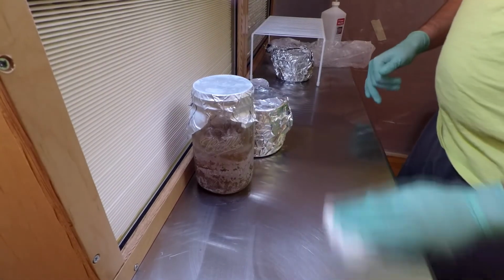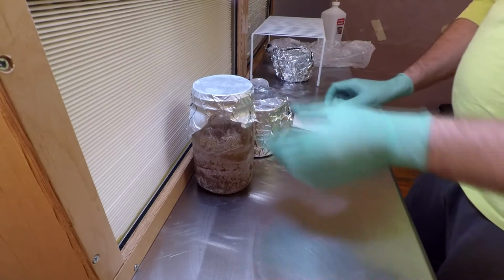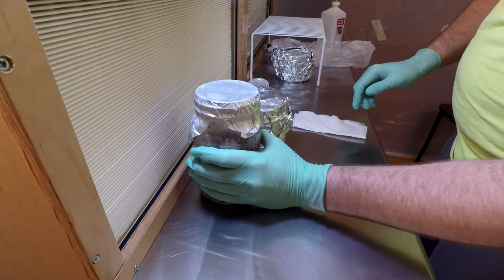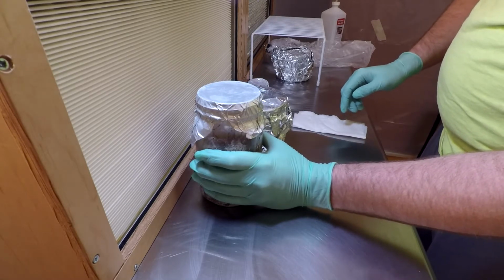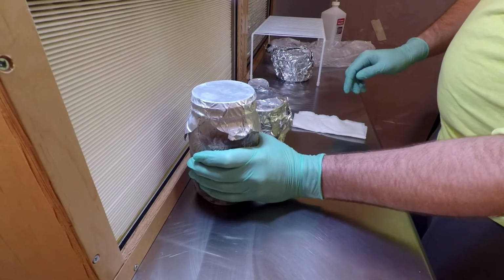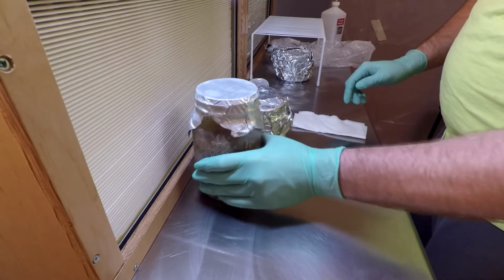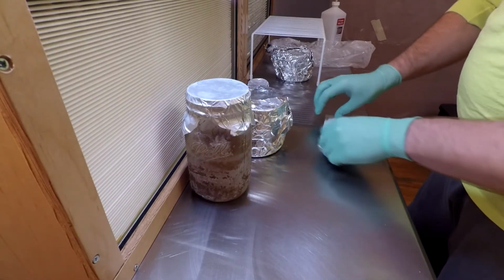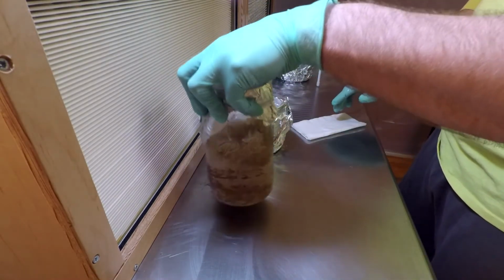A good rule of thumb to figure out when it's appropriate to pour the agar is, obviously it's still liquid, but if you can grab a hold of the jar and keep your hand on it for about 30 seconds without it getting too hot, it should be pretty cooled off, ready to go. Okay, you want it warm but not hot, and it might take you a time or two to figure out when the jar cools down enough that it's not going to gel the agar.